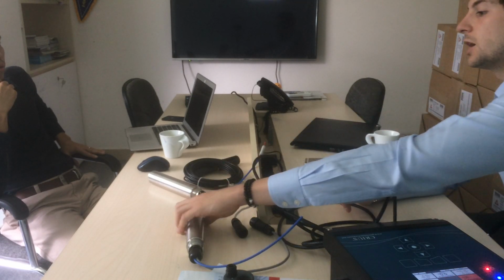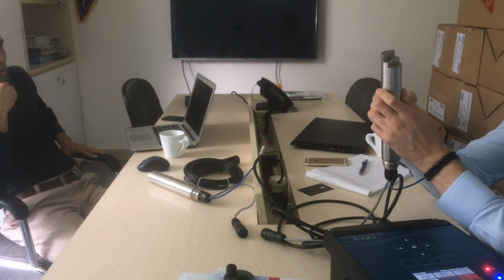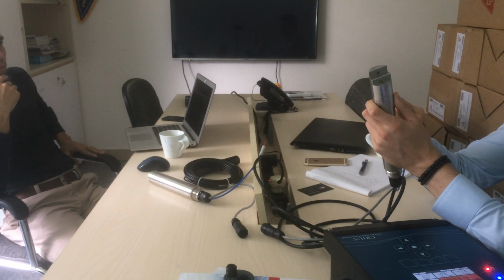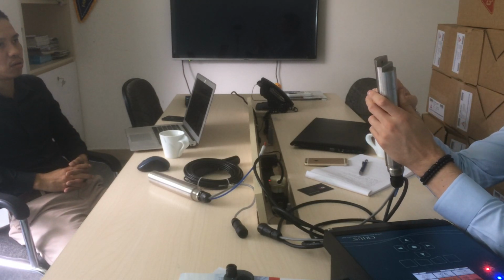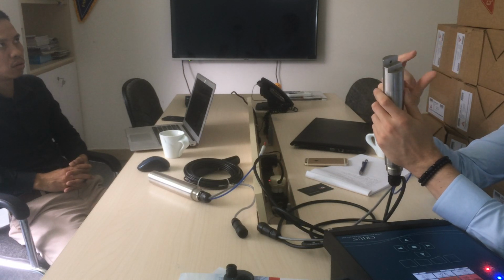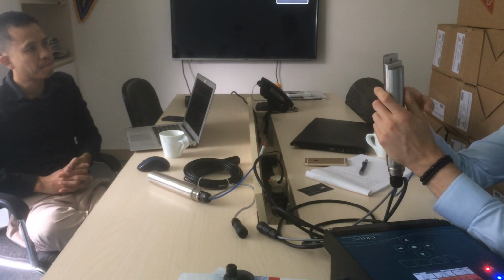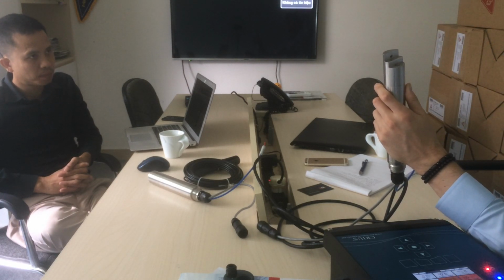Inside here, you can't see it, but we have a second detector. So we have one emitter, but two detectors. When we do a calibration, the second detector measures the light output. So we output 100%, then 75%, then 50, and then 25. We extrapolate backwards, and we extrapolate to zero.